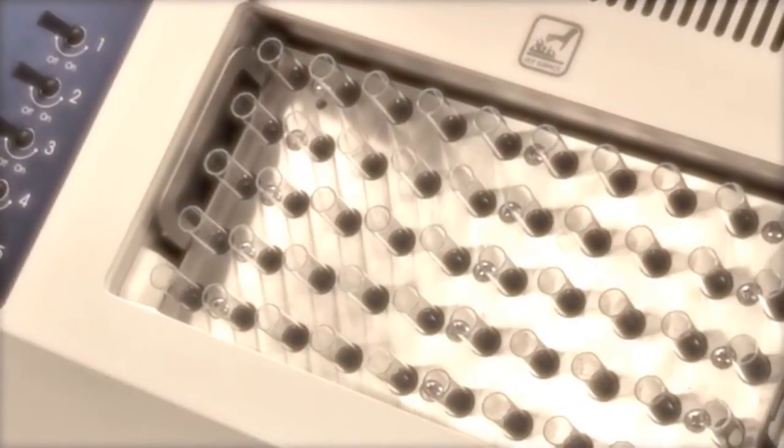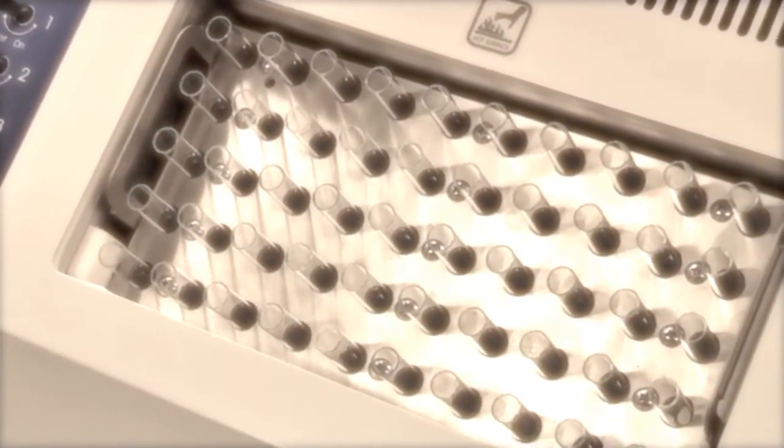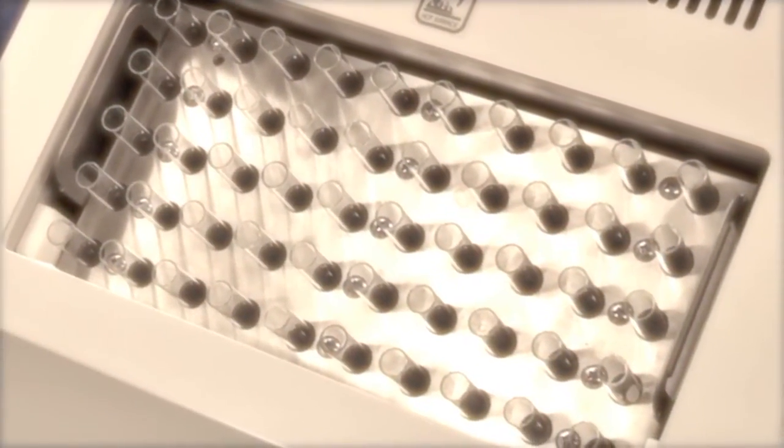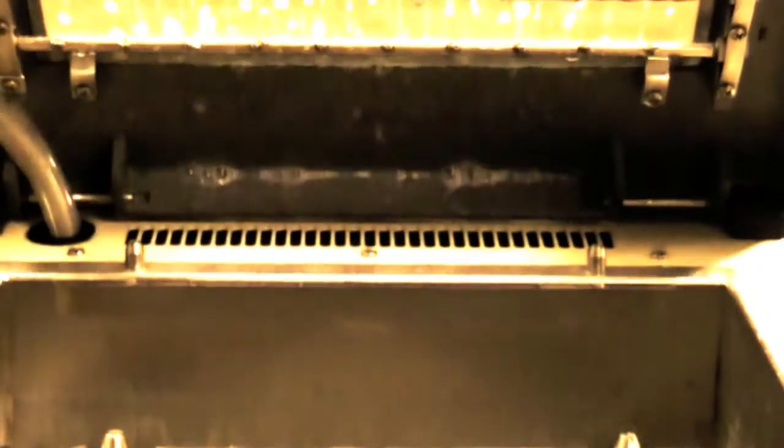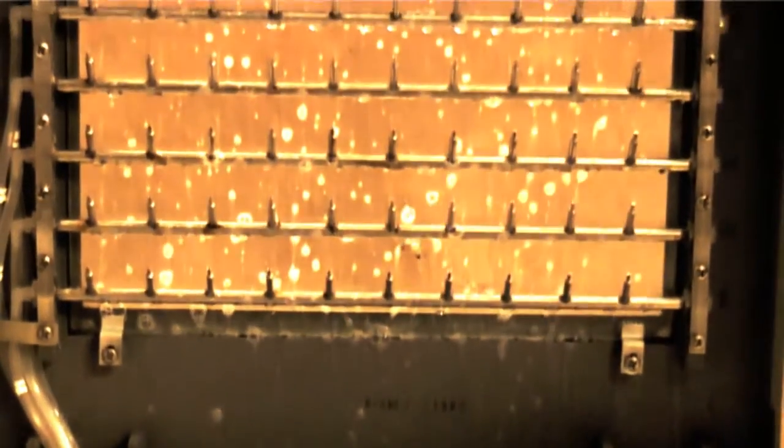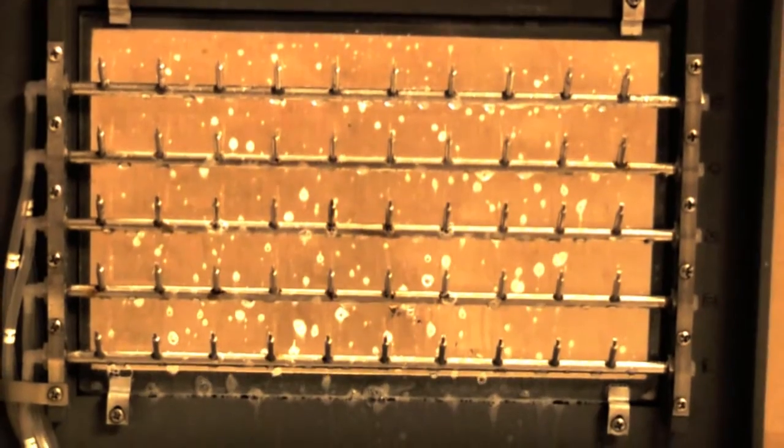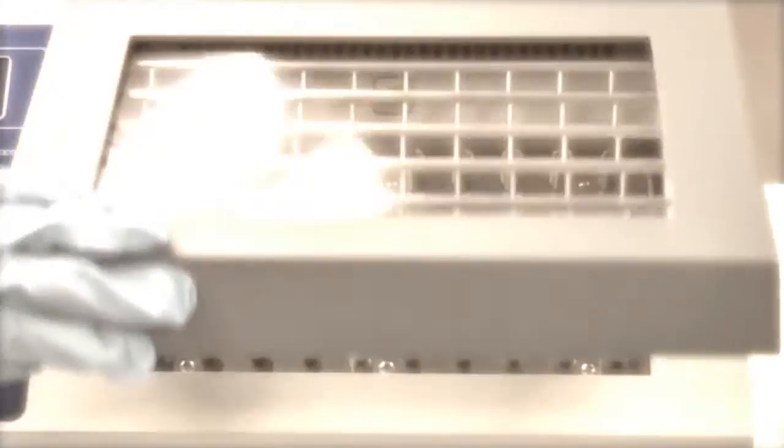Water baths are messy. A dry block is not. Water baths can condense and drip back into your samples. A dry block does not.